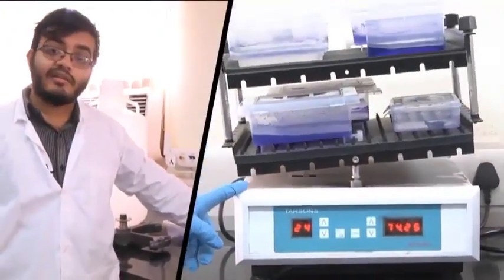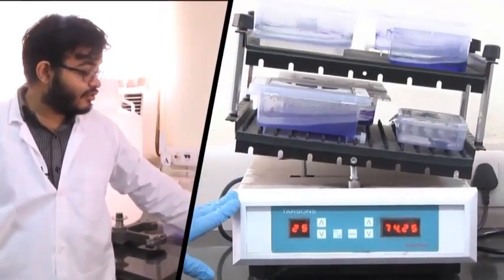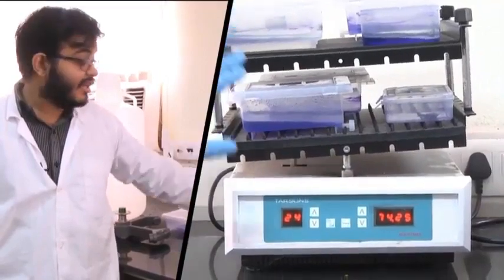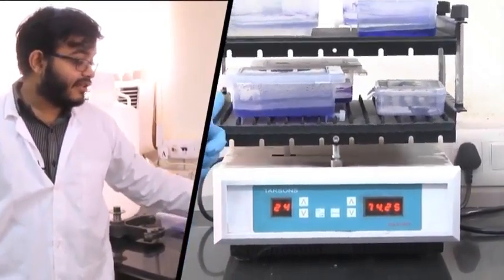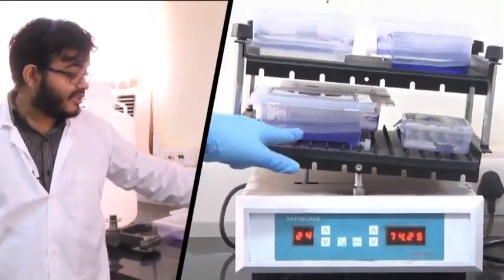So what we have here is a gel rocker. Basically, as you can see, this is an instrument which has a rocking platform on which we keep our different boxes. Inside our boxes we already have different SDS-PAGE gels, and you see a blue liquid inside the box, right?